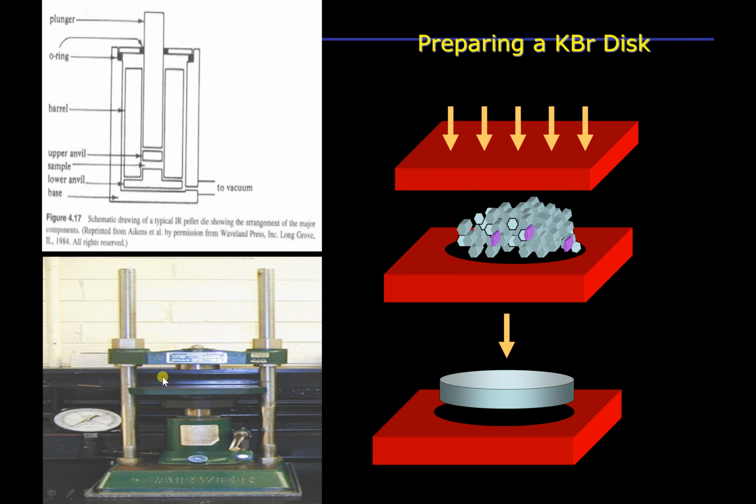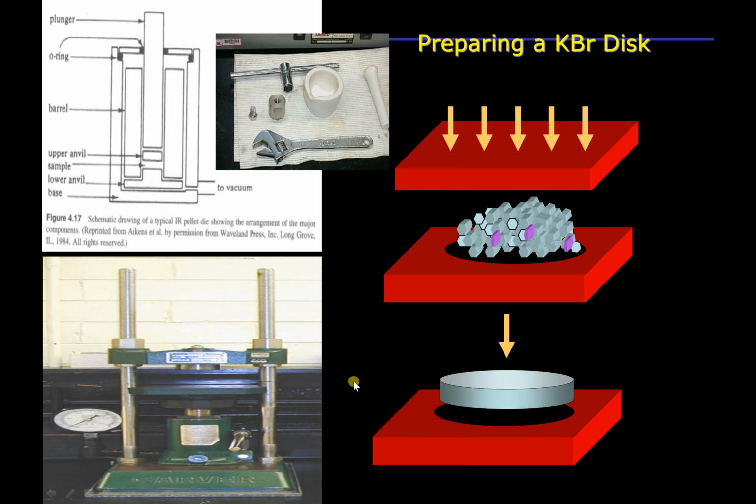This looks something like this. Yeah, there is a manometer to measure it, and here you get a pellet, and this is triturated in an agate mortar and pestle, and this is the monkey spanner, and this is the handle of this plunger. So these are used to maneuver this.